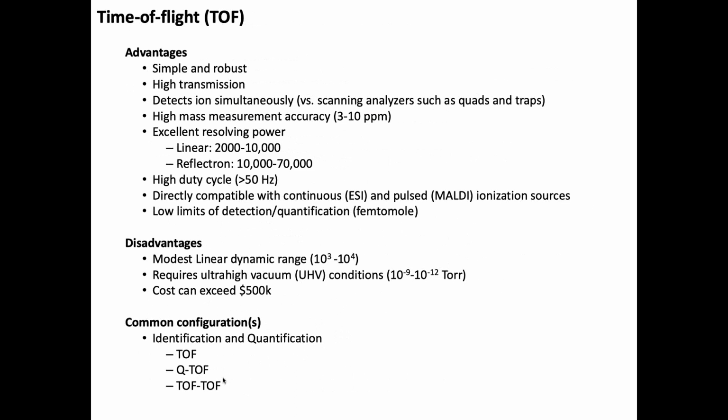So when you start talking about mass accuracy, how accurately can I define the mass of my target biomolecule or its fragments, an Orbitrap is far superior to a TOF. Resolving power, mass accuracy. But what a TOF has is very high rep rates. You can do lots and lots of experiments in a very small unit of time that you maybe can't do as well in an Orbitrap.